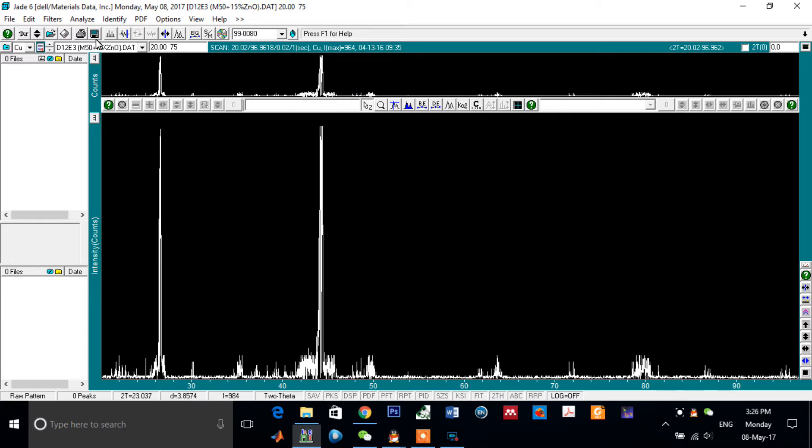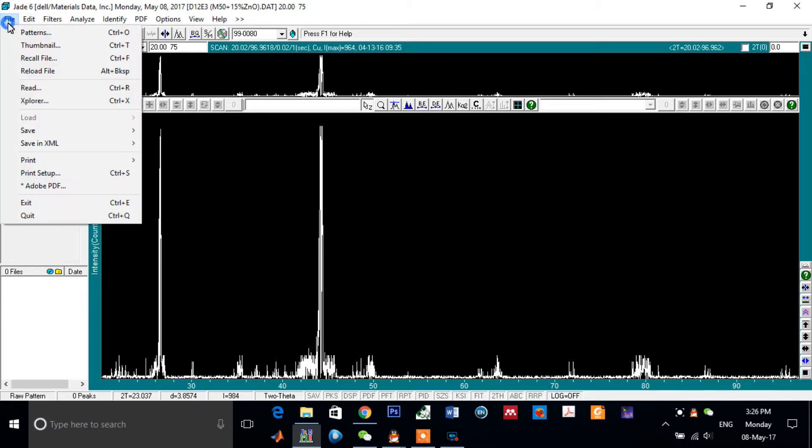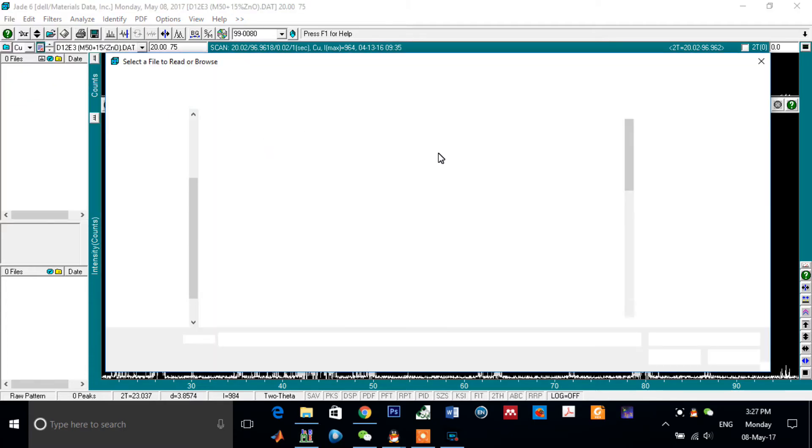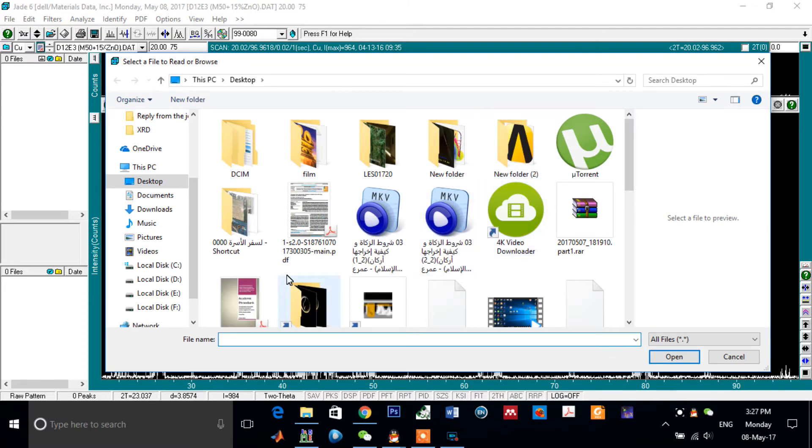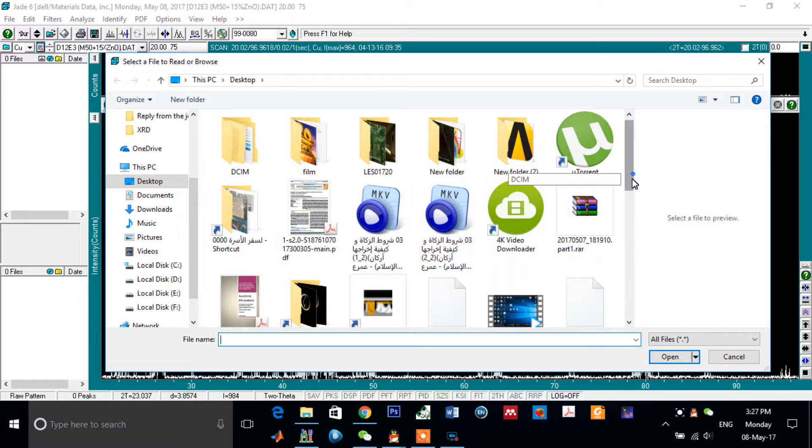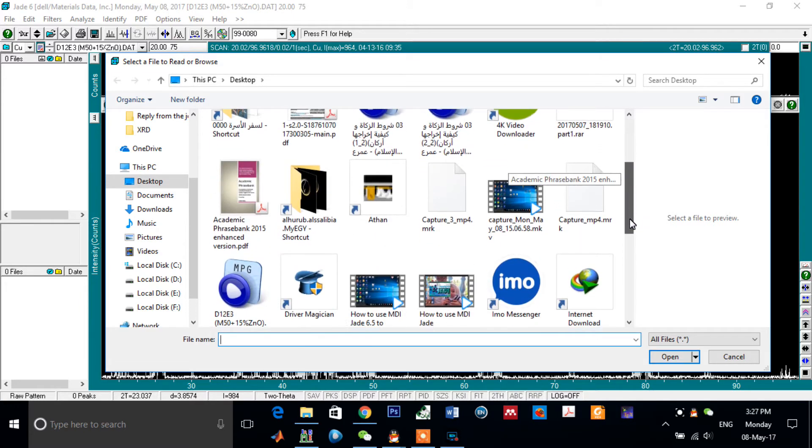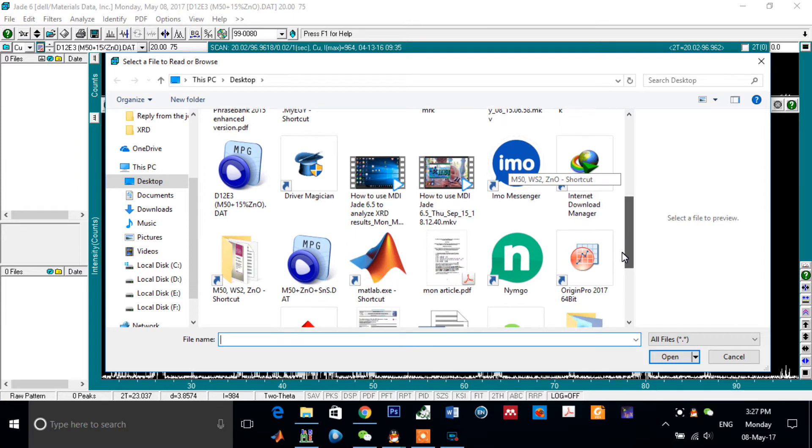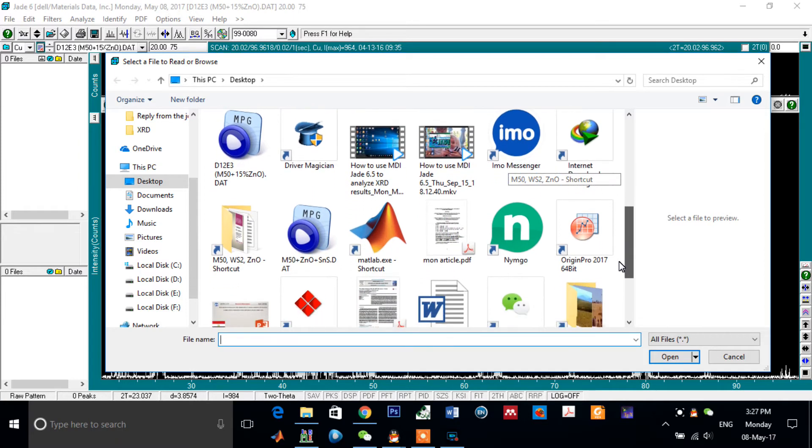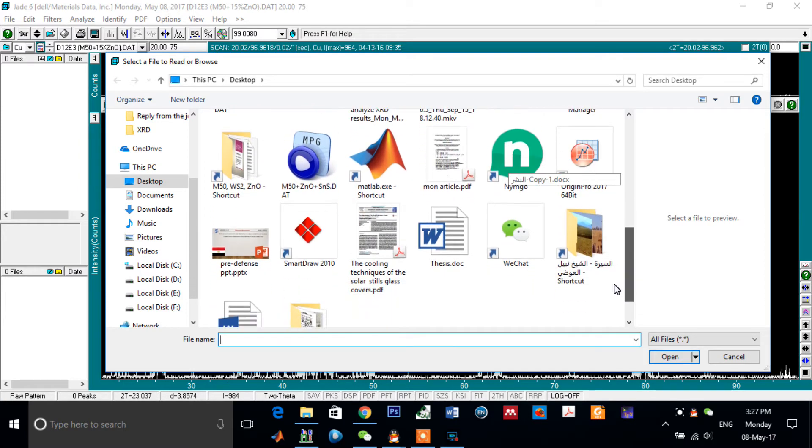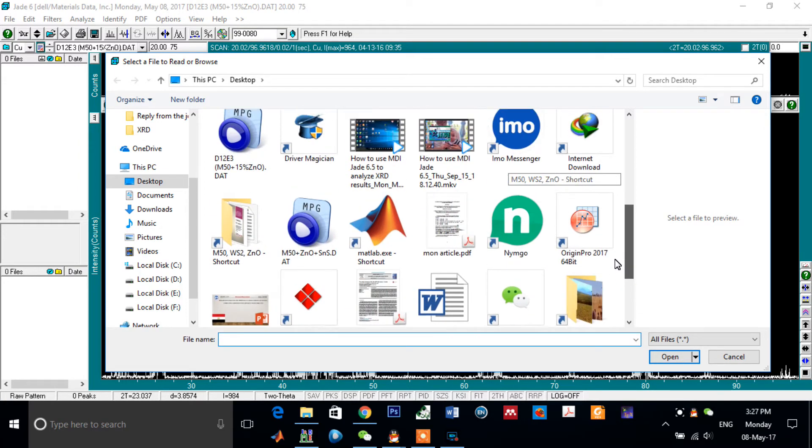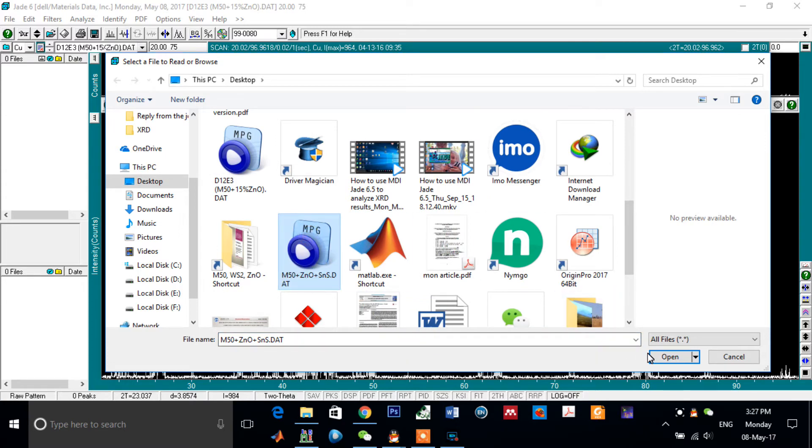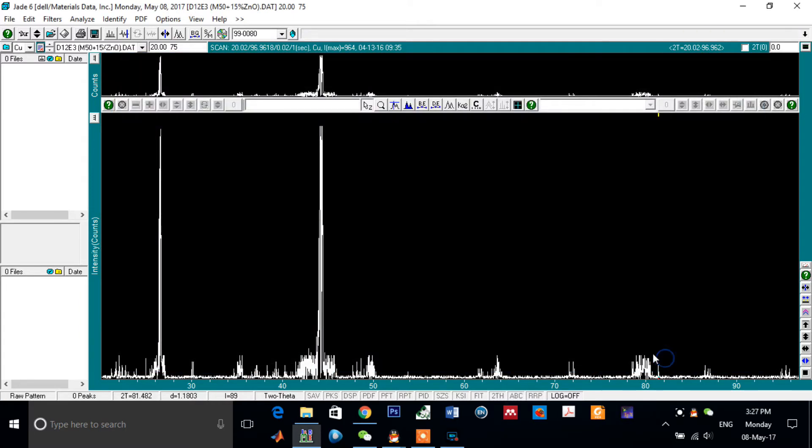Here we go, click on File, Read, and choose the data file. Here, as you see, this is the data file of my sample. Open it.